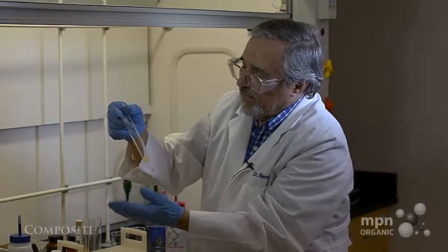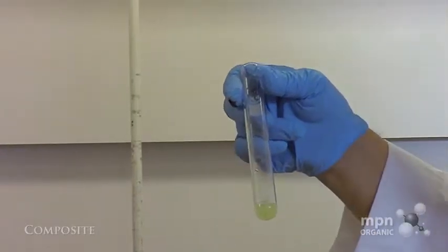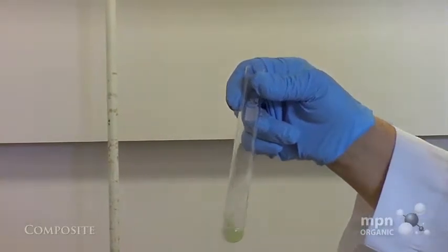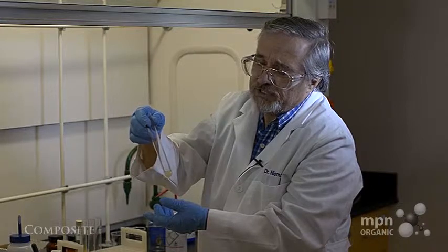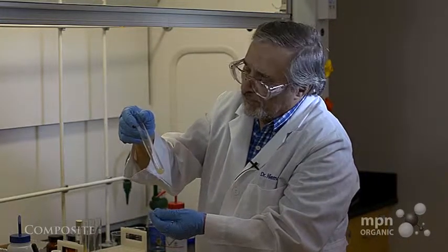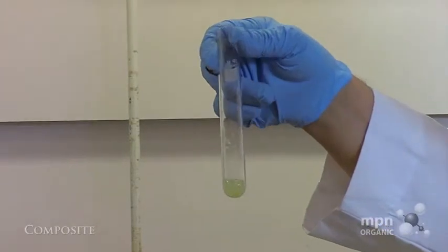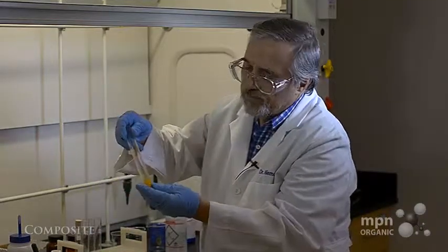So the idea that your qualitative tests indeed produce these compounds is confirmed by these further tests that you can do on the oxidation product of 4-methyl-2-pentanol to 4-methyl-2-pentanone. Let's just show you that.